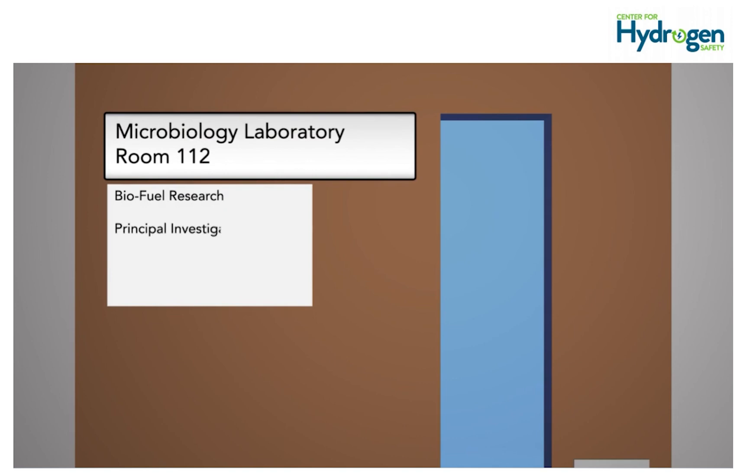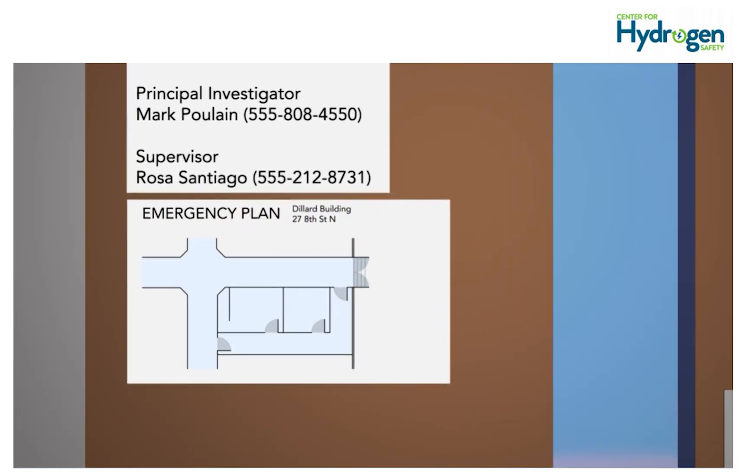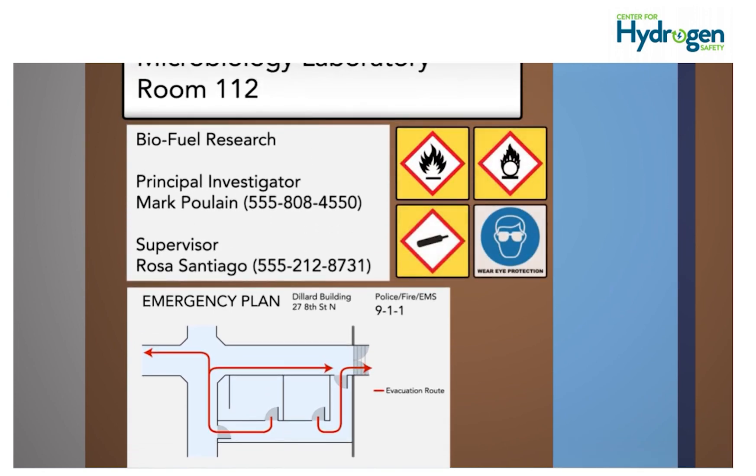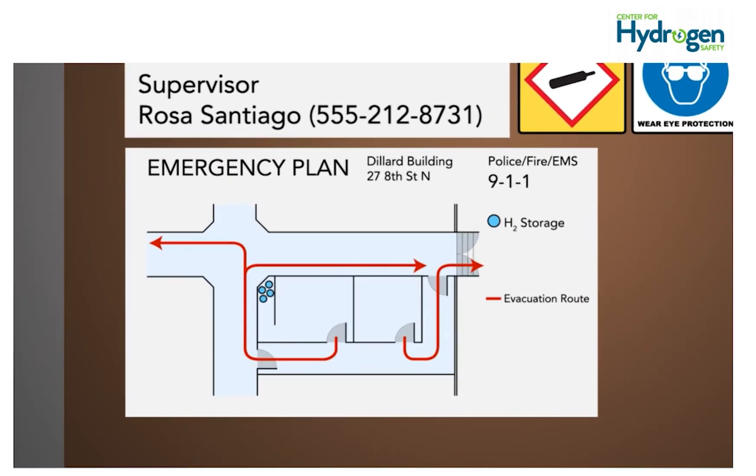The names of all principal contacts such as the principal investigator or supervisor along with their contact information; the name and address of the building; emergency response and call information as well as multiple emergency evacuation routes; identification of all hazards present in the workspace; and a map showing the location of hydrogen storage as well as the primary and secondary gas shutoffs.